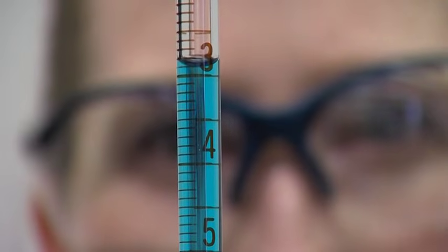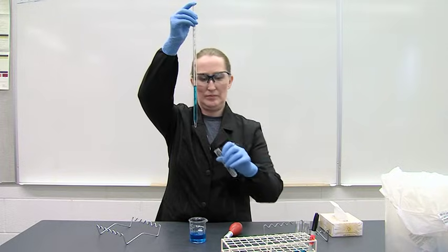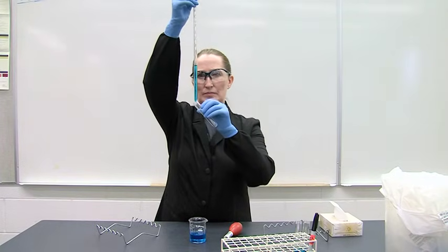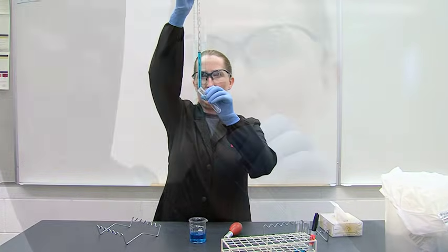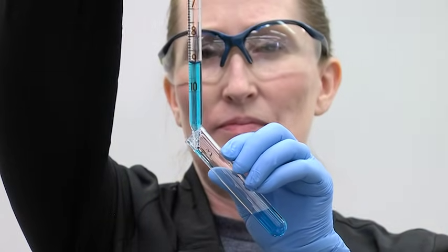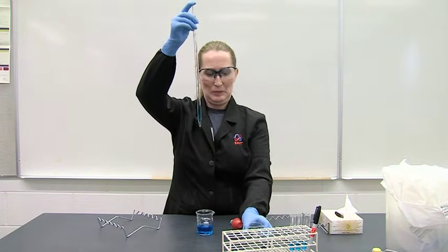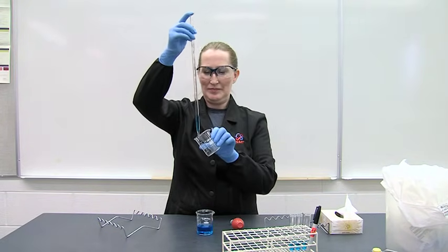Repeat this step if you are measuring multiples of the same volume, raising the next graduation line to eye level for each delivery. Remember, do not drain to the tip. Mohr pipettes are only calibrated to the last graduation line before the tip.